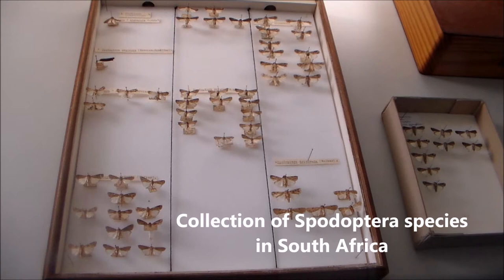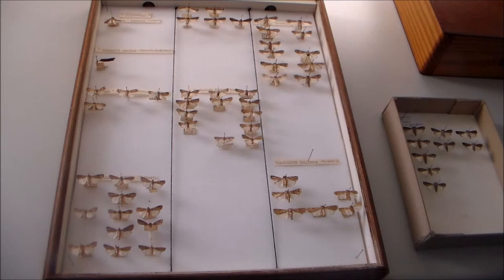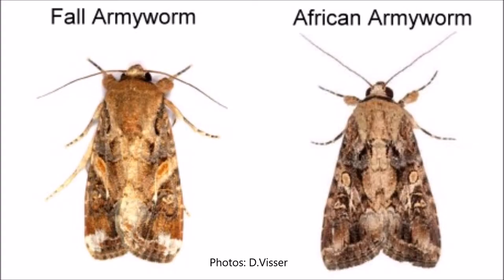There are 7 species of Spodoptera on the African continent, with the moths very similar in appearance. Here you can see the similarity between the fall armyworm and the African armyworm male moths. The male reproductive structures do have characters to differentiate between the species, but this requires dissection of the genitalia.